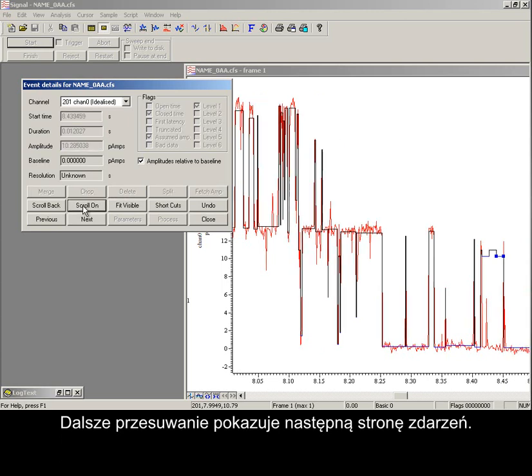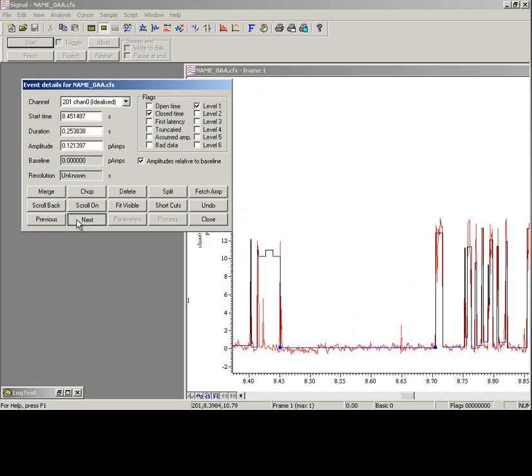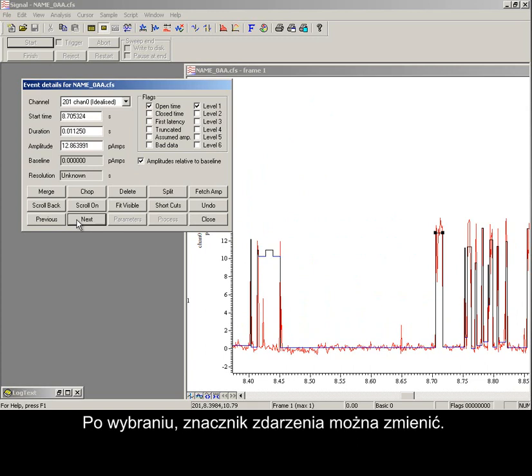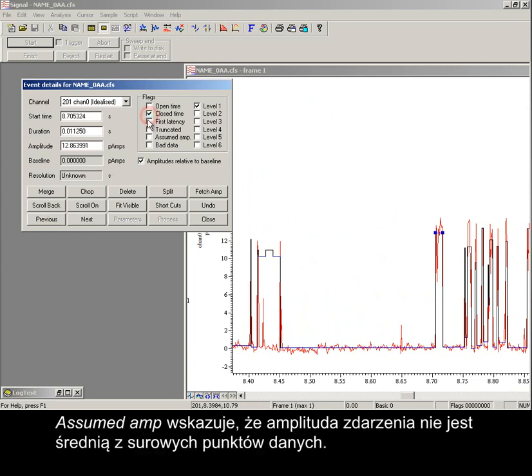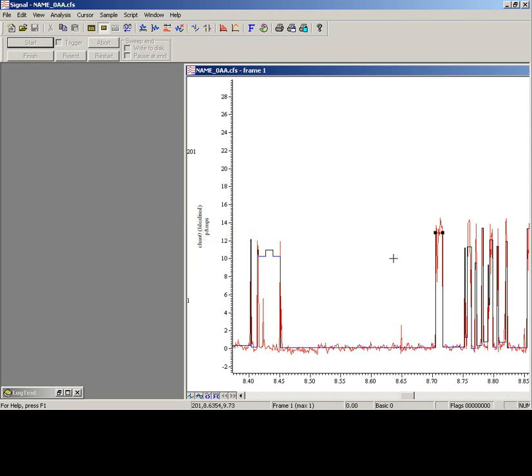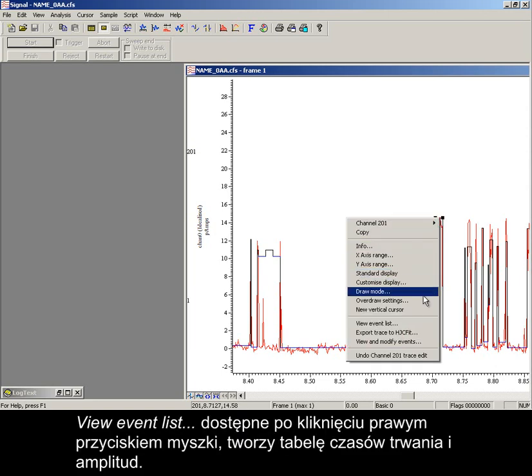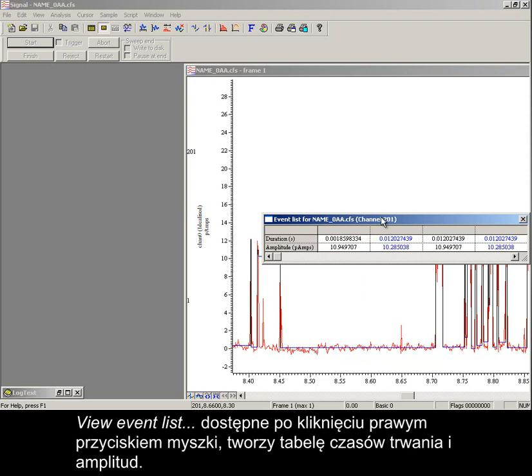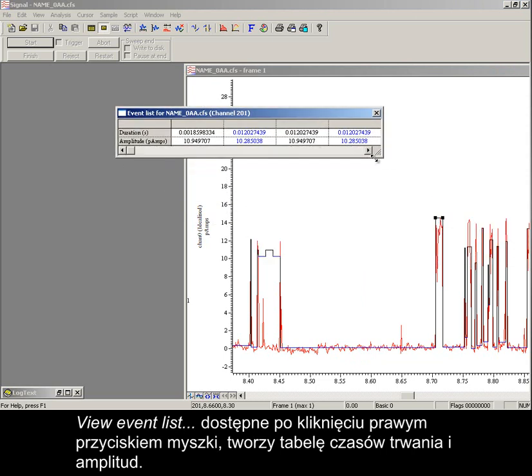Scrolling on presents the next page of events. When selected, an event's flags can be changed. Assumed AMP indicates that the amplitude of the event is not an average of the raw data points. Any event flagged as bad data will not be included in any analysis. View event list via a right-mouse click produces a table of event durations and amplitudes. Color variations indicate opened or closed state.